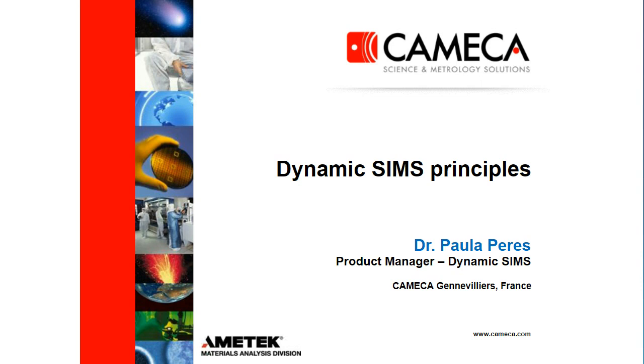I am the product manager of CAMECA IMS-7F Auto mass spectrometer. CAMECA is, as you may know, a manufacturer of magnetic sector SIMS instruments. This talk will describe the main principles of the dynamic SIMS technique.